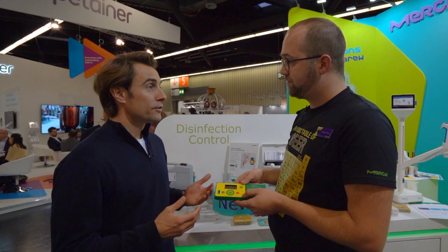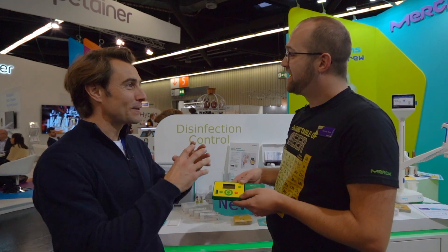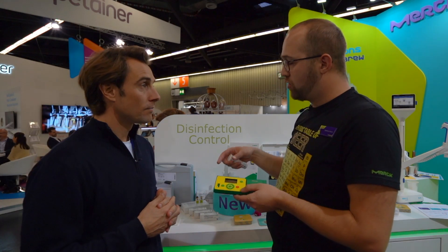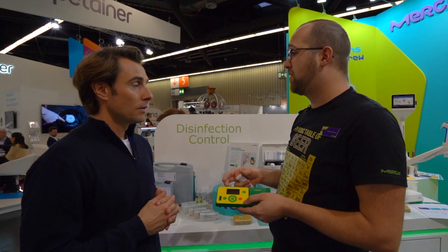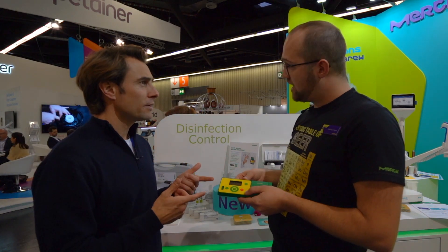So finally, that's a strip reader. Exactly. I could have been part of the marketing team — the strip reader. Exactly. And the good thing is also that what is coming more and more is that you have to test the instrument as well. Your eyes you can't test, but you can test the instrument. And this is very important. So you can control and do a sort of calibration. Exactly.